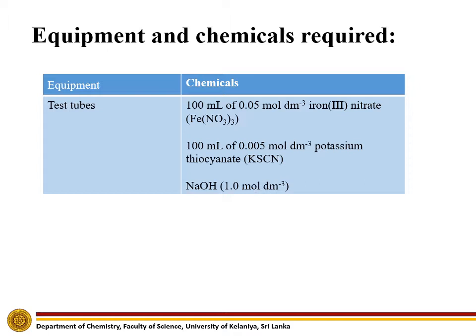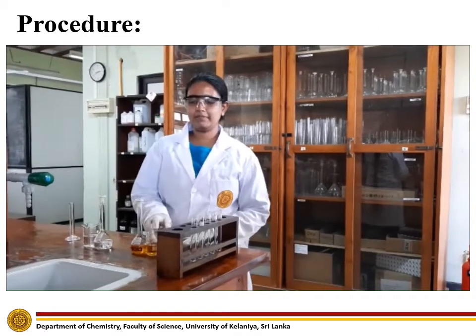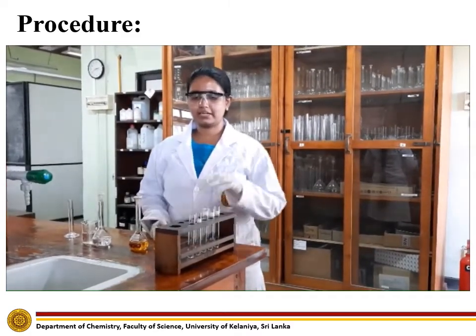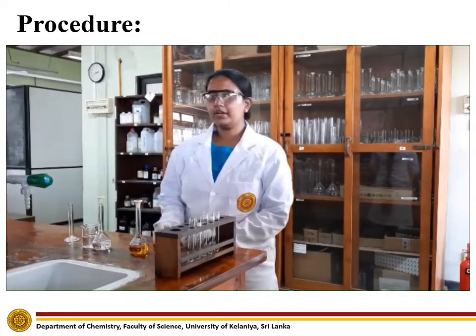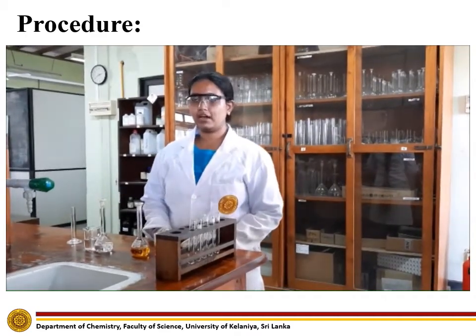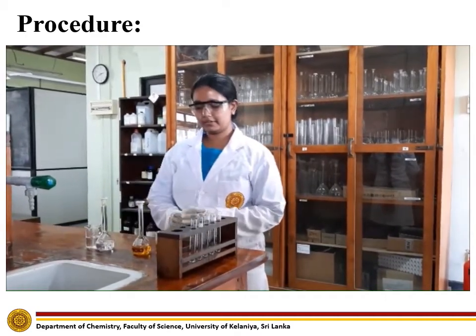Now let's see how the experiment is done. First, put 2 ml of ferric nitrate solution into a test tube. Since this is a qualitative experiment, volumes can be measured using a measuring cylinder.